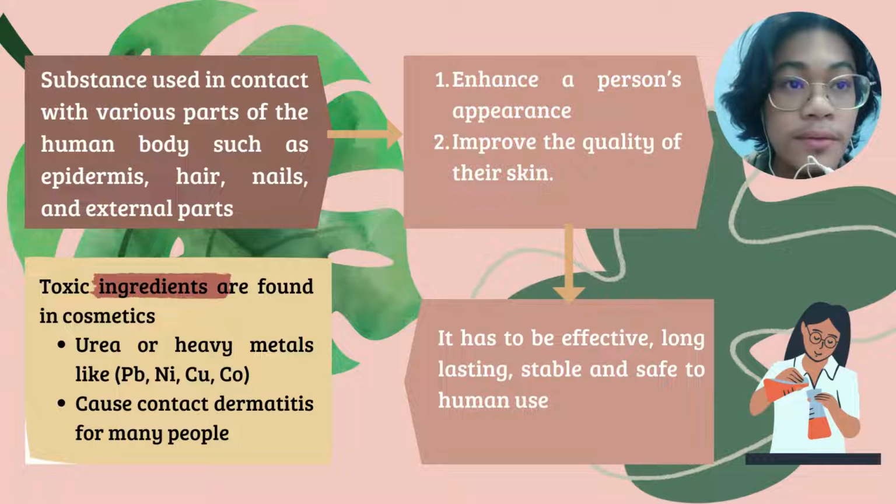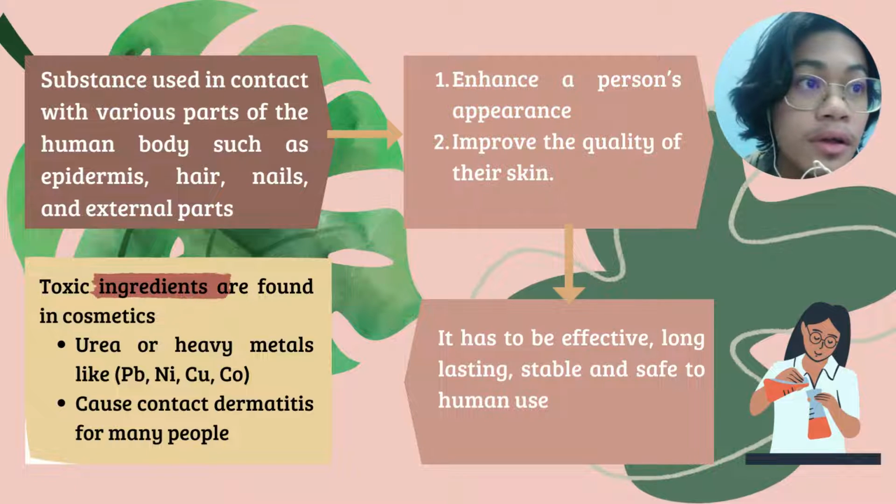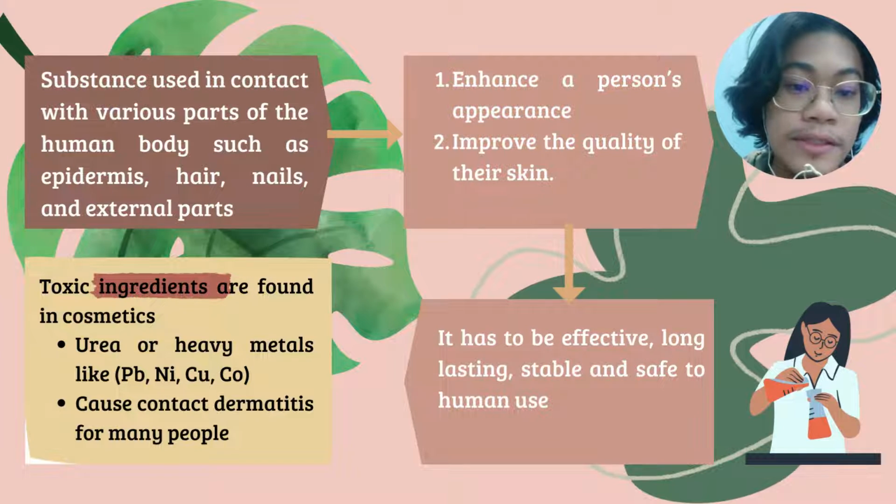Hello everyone, we are from Group 1. We will present and explain about chemical analysis of cosmetics by using spectrophotometry.